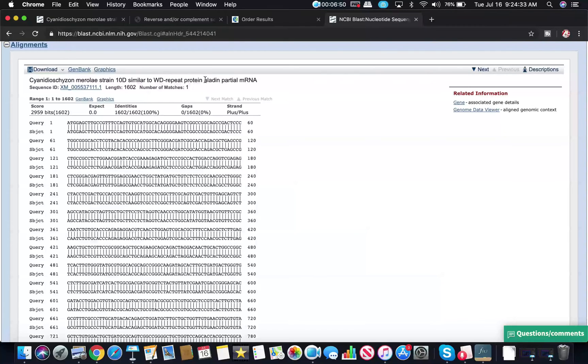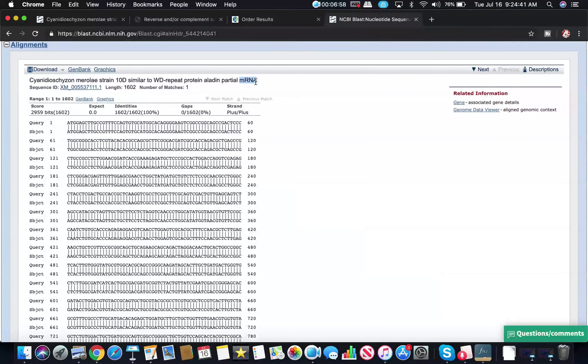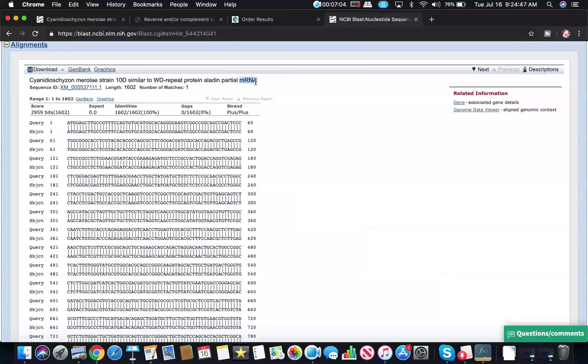So I want to point out several things about this. One, it does indicate it's the protein Aladdin here, which is very good. It says mRNA, which is okay. It doesn't have to be the DNA. That's because the mRNA that encodes Aladdin is going to be complementary of the gene in any case. So if it says mRNA, that's okay. It doesn't have to be DNA.